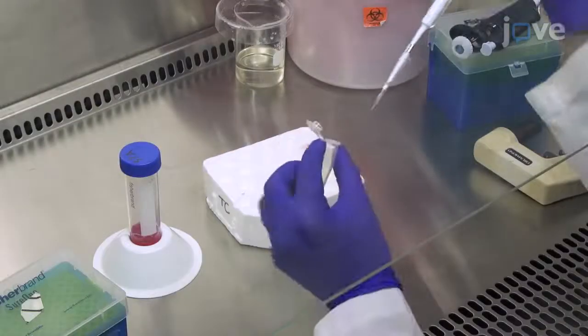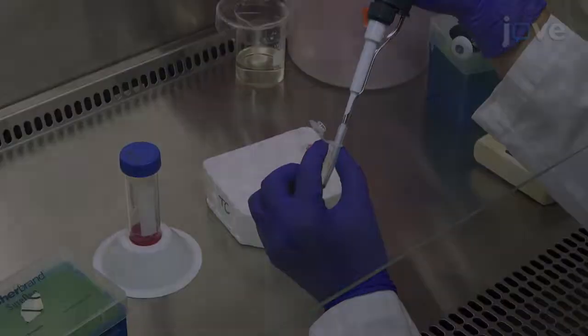Combine 10 microliters of cell suspension with 10 microliters of trypan blue, pipette up and down to mix.